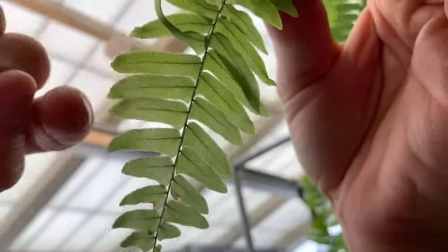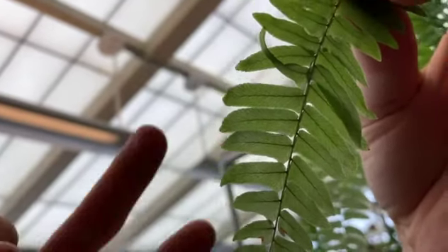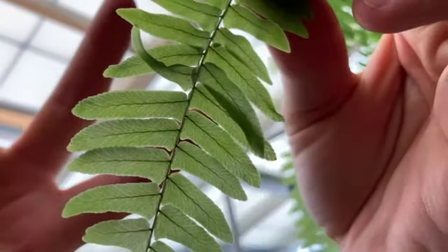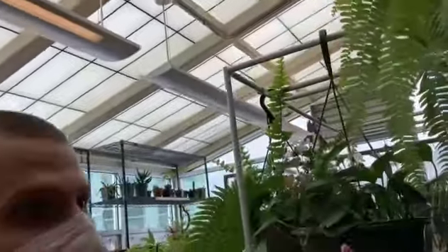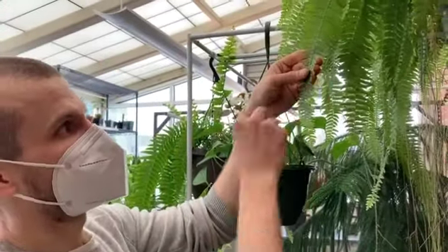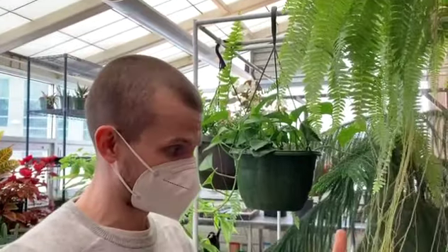And now I'd encourage you to additionally take this under the microscope and see the branching pattern, because what you'll find is dichotomous branching in each of the little veins coming off of the main vein of the fern leaf. Now this fern, as a spore-bearing plant, will make what are called sori on the underside of the leaf. Now it's not the mating season for this Boston fern.